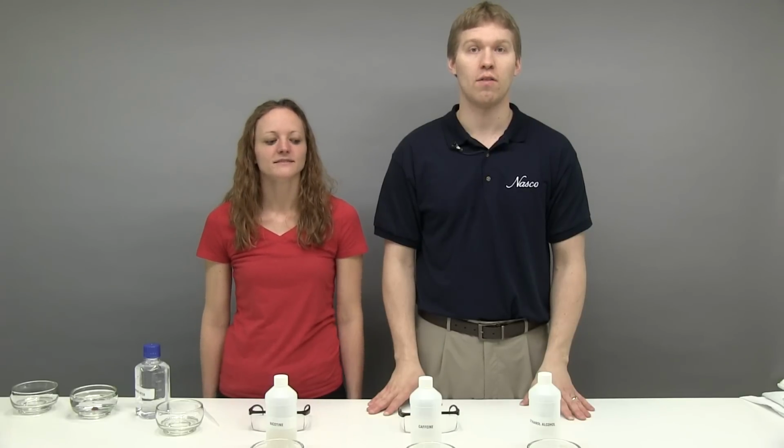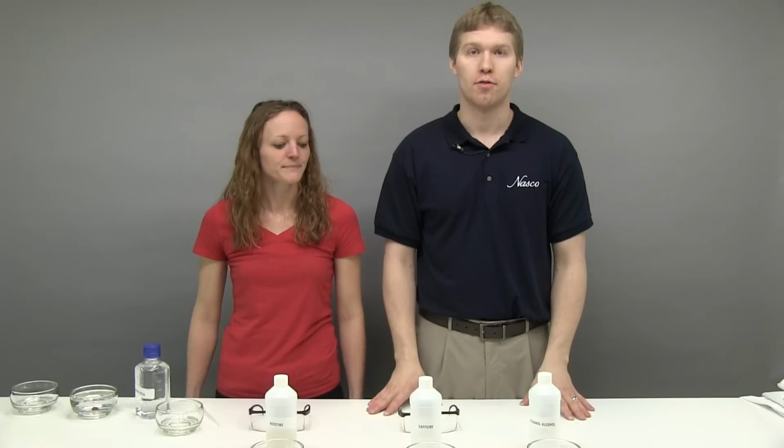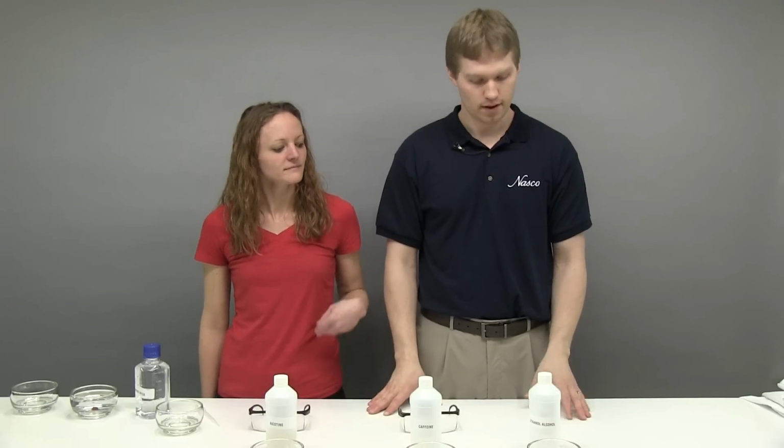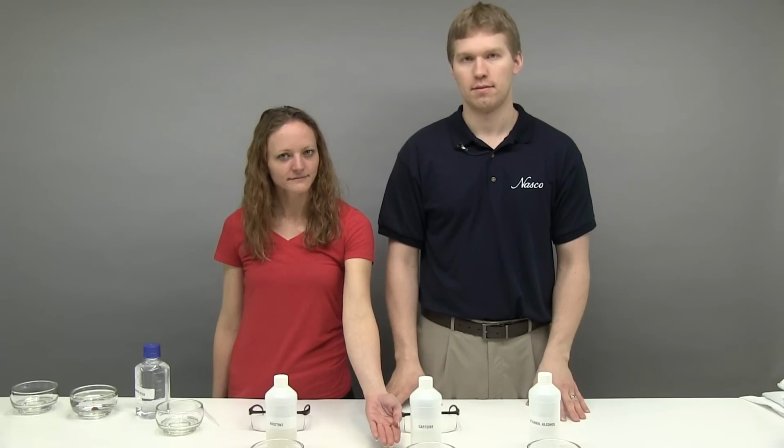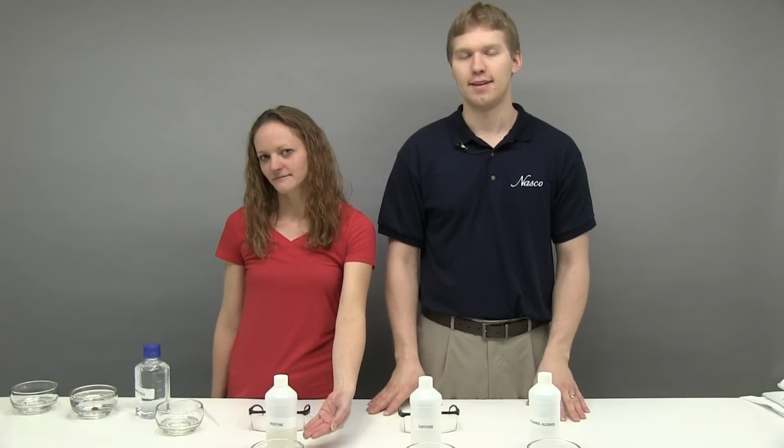We're going to be doing a brief observational experiment with various toxicants, and we're going to see how they affect the behavior of blackworms. The three toxicants that we're going to be using are ethanol alcohol, caffeine, and nicotine. Let's suit up.